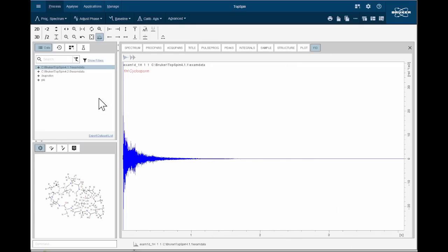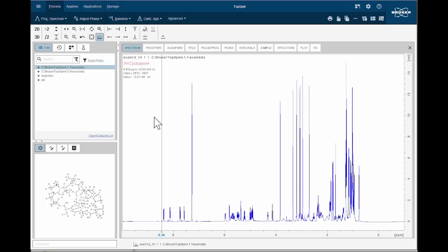So let's revert back to the spectrum. Here we have the spectrum exploration tab, where we have to add our data, and this is the molecule in 2D representation, and here below we have a command line.